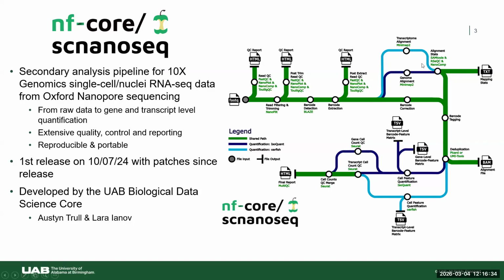With that being said, the alignment step will be a point in the analysis that has to be configured separately because we need to pick the right references. While the alignment is happening, we also perform barcode extraction, which is currently done with a custom script in the pipeline.